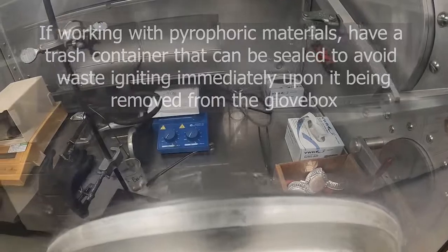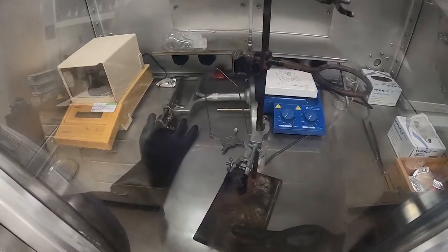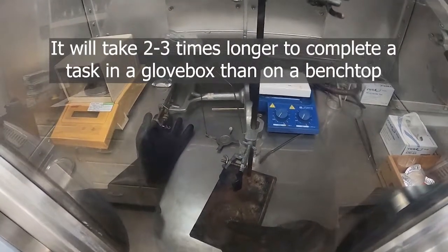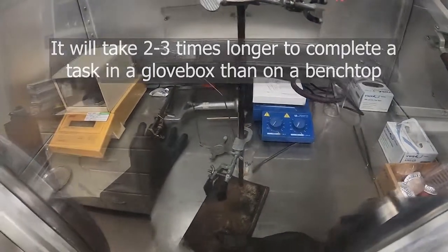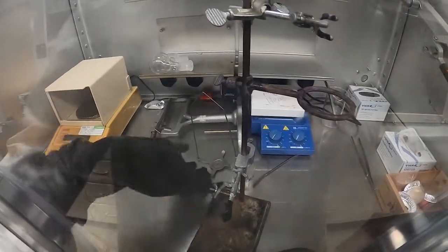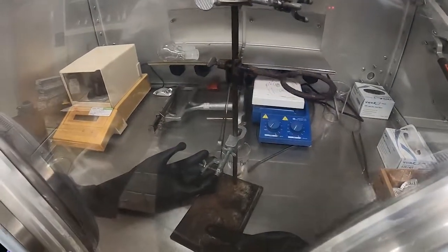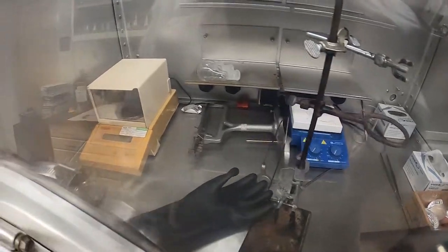It's important to remember that any time you're working in the glovebox, estimate that anything you're doing in there will take about two to three times longer than it would out on the bench or in a hood. It's just a lot harder to work in these gloves, harder to reach things, and harder to see because of the window you're looking through. It always just takes much longer to do things in the glovebox, so be aware of that.